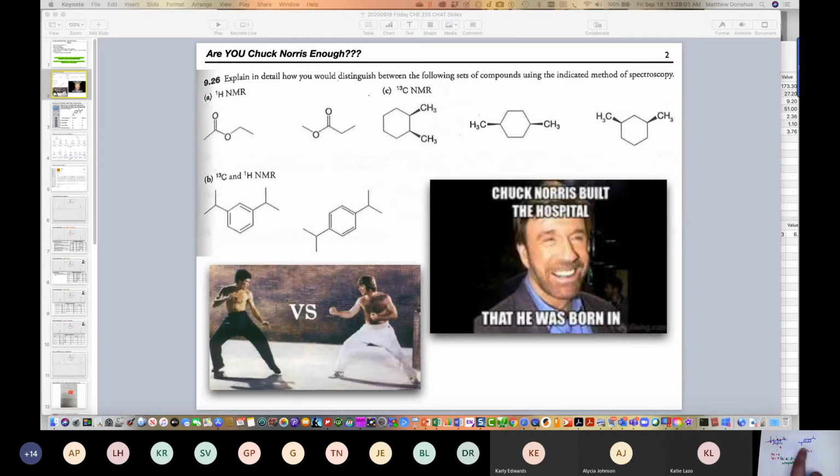So when you look at this molecule and you determine the molecular formula, you're coming up with, say, 12 total carbons. But you're not going to see 12 signals in the carbon NMR, and that's due to the symmetry. So that's what we're figuring out now. So I see Ian and James put down 4, and 4 is the correct answer. So how did we come up with 4?